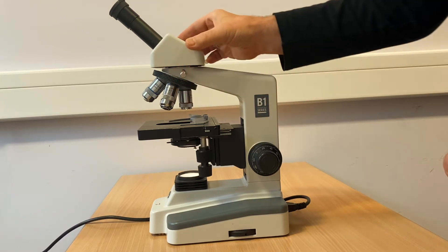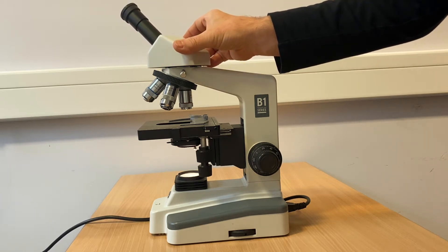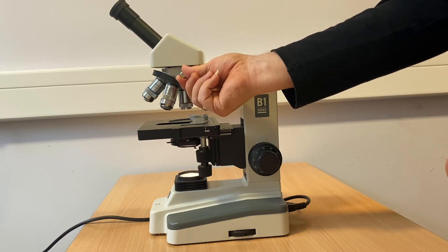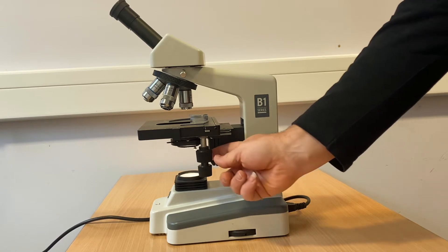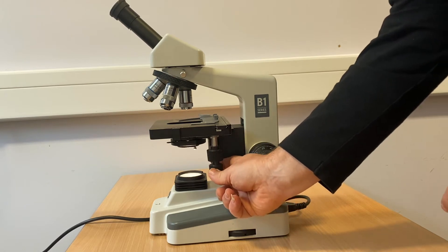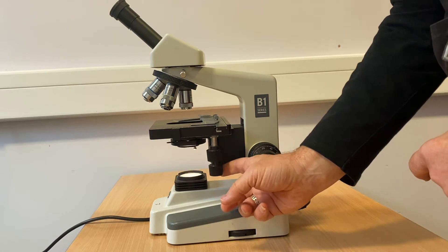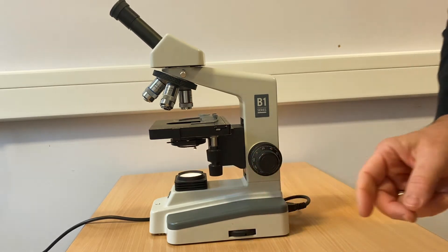Releasing the silver grub screw below the eyepiece turret allows the eyepiece to be rotated, and conversely tightening the screw locks the eyepiece in position. Moving the microscope stage to locate specific items on a specimen is achieved by the stacked rotational controls underneath the stage itself. The upper control moves the stage forward and back, and the lower control moves the stage right to left.